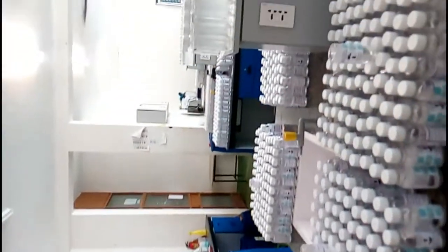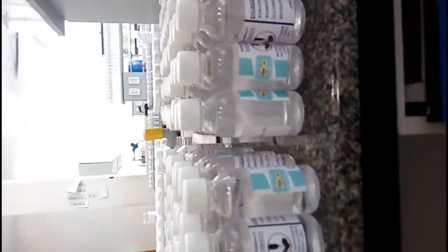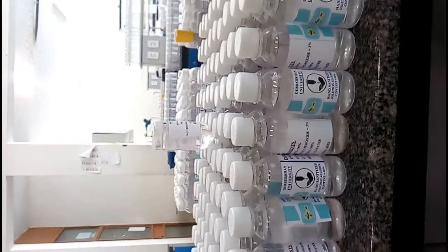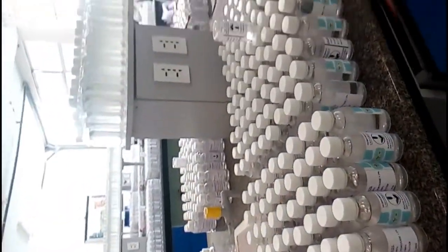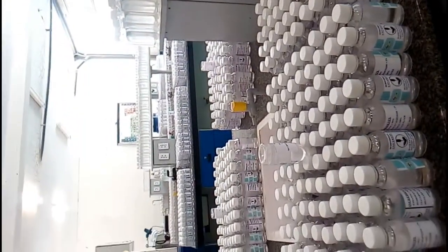So, in general, to prepare this sanitizer, different steps are there. As a chemist, we can use the dilution law. What is the dilution step here?